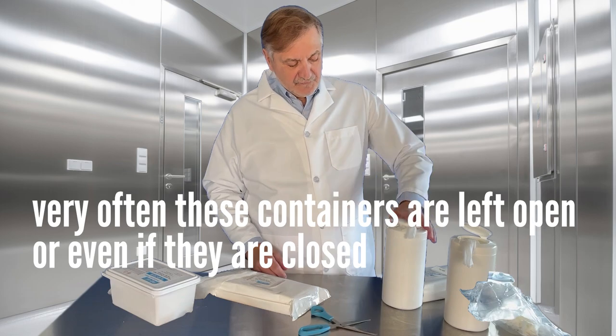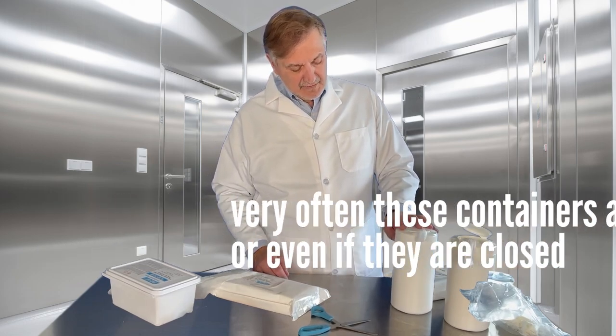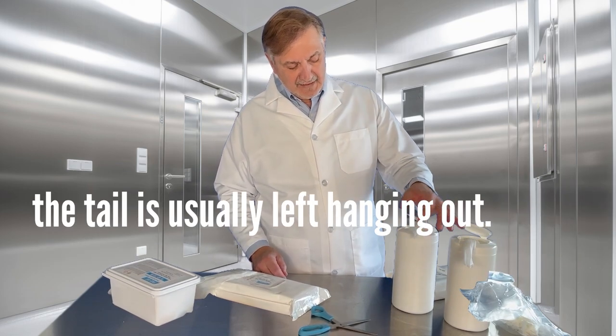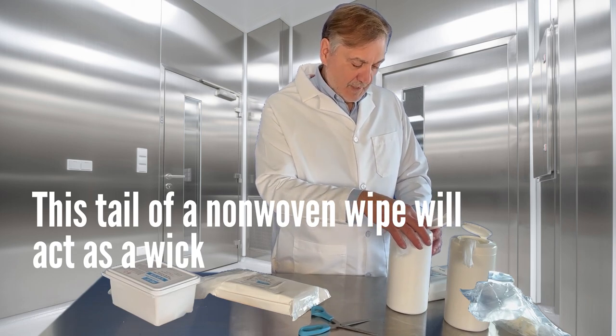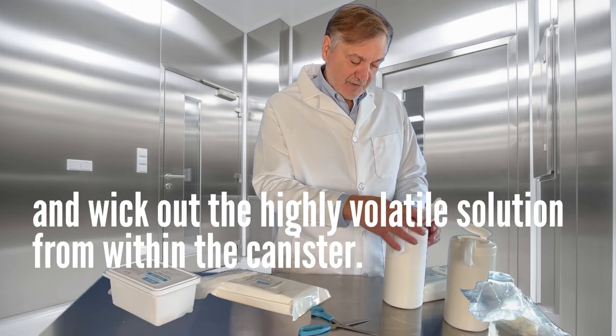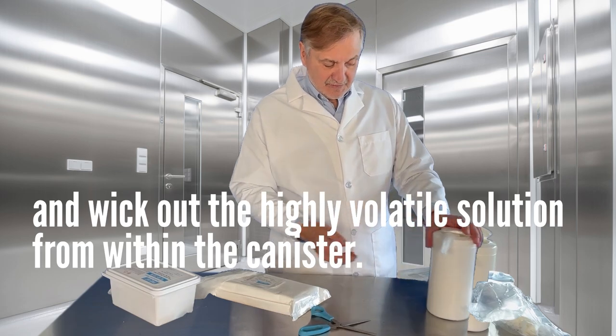Very often these containers are left open, or even if they're closed, the tail is usually left hanging out. This tail of non-woven wipe will act as a wick and wick out the highly volatile solution from within the canister.